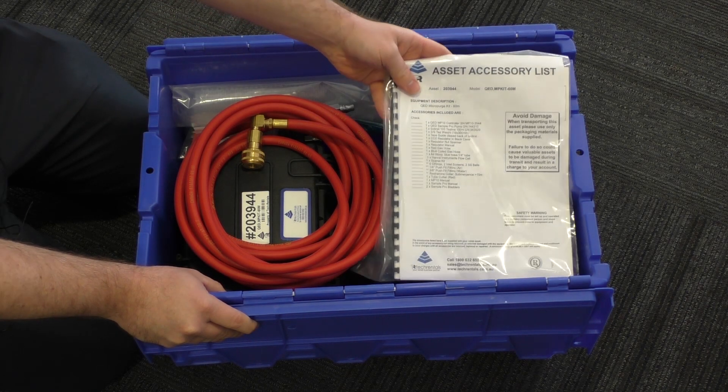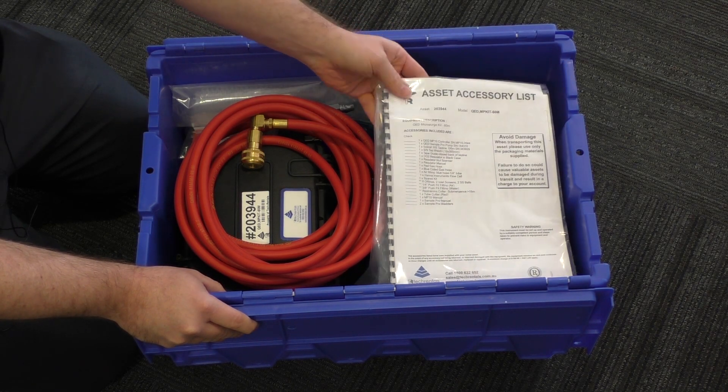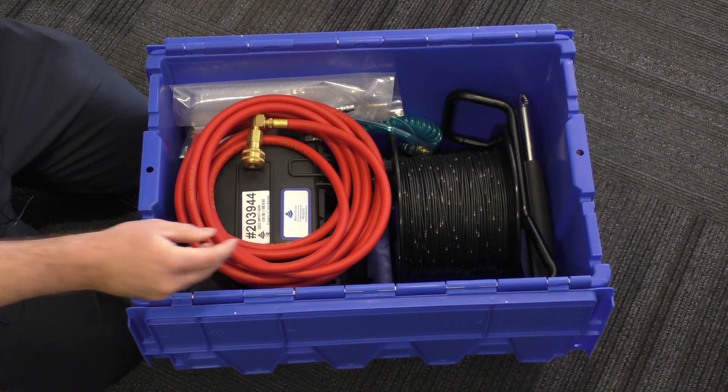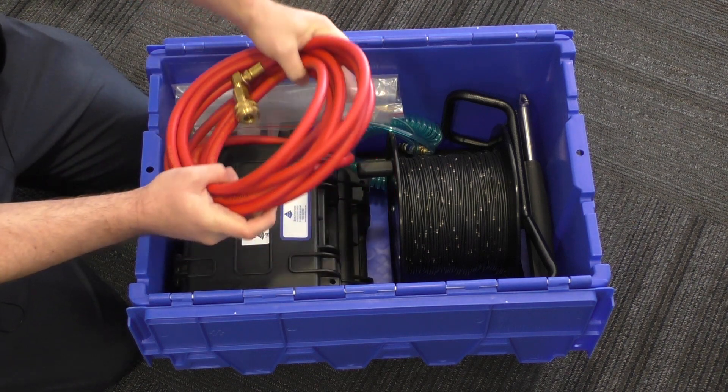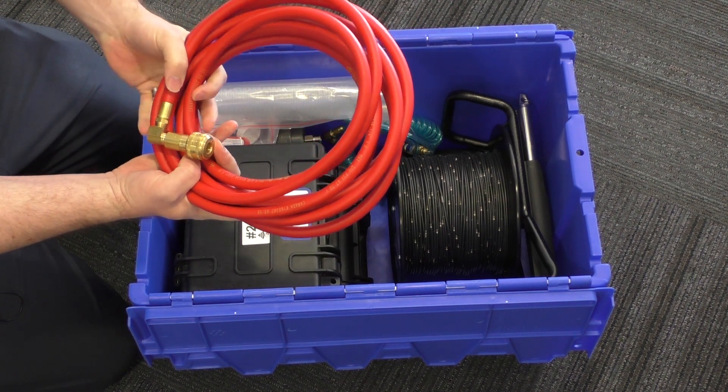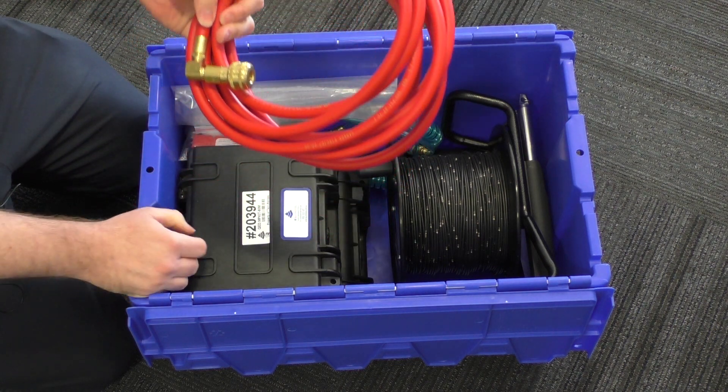Looking inside the kit, there's a bit of a knack to getting everything in the box, but inside we've got the accessory list, the manuals, and this is our gas hose which connects from either an air compressor or a CO2 regulator to the MP10 controller.